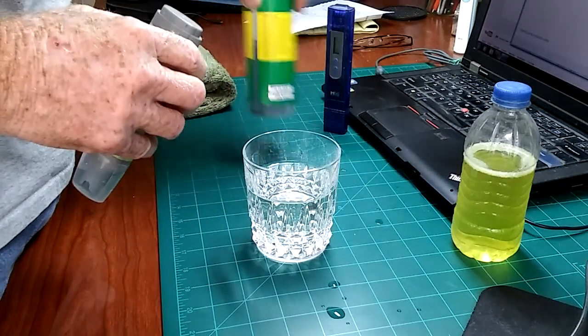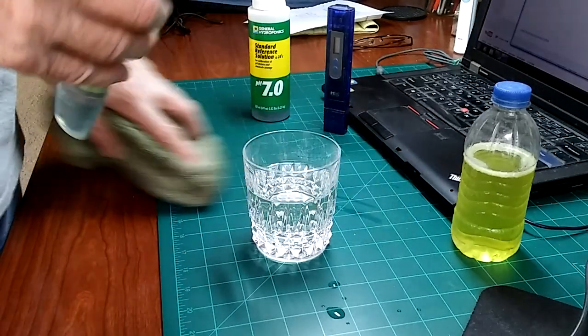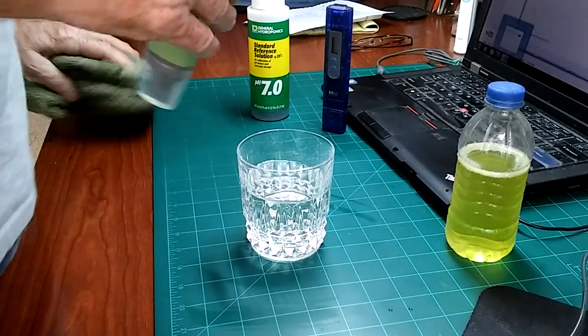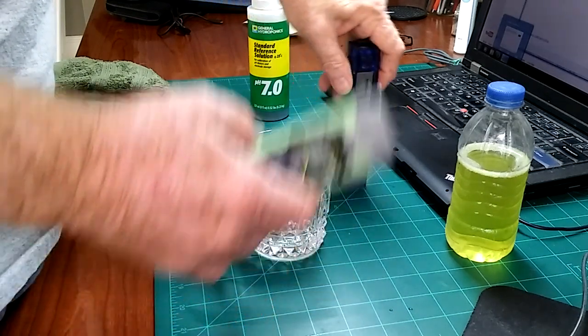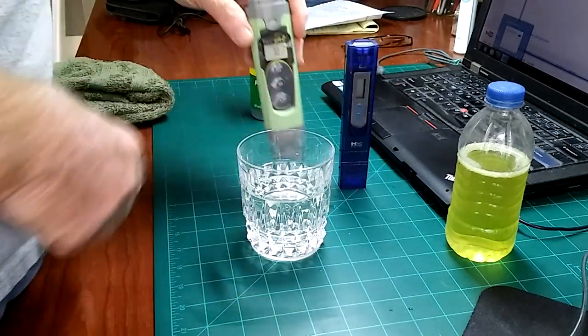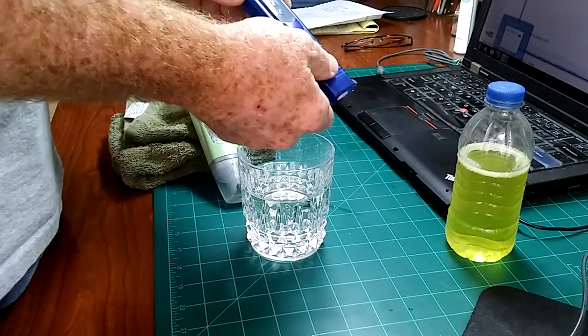Good afternoon. I'm going to do this at my desk, and I'm probably going to make a mess, but that's okay — it's for a good cause. So, TDS meters or PPM pens, and pH meters or pH pens. Let me give you a couple of quick tips on how to use these meters.